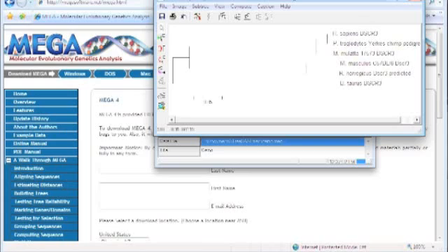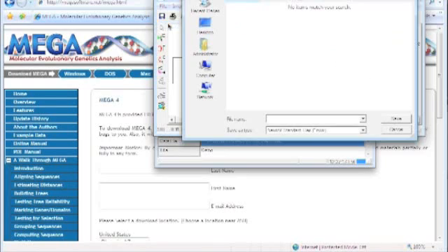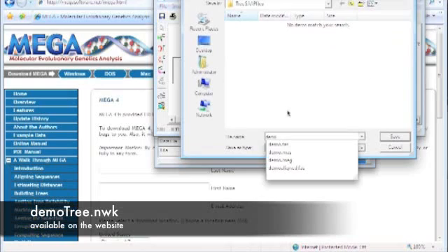Alright. Now, in order to get TreeSap to work, we're going to need specifically two things: one was our saved alignment file, which we already did, and the second one is this tree right here. So we're going to File > Export as Newick, and we can just call it 'demo tree.'